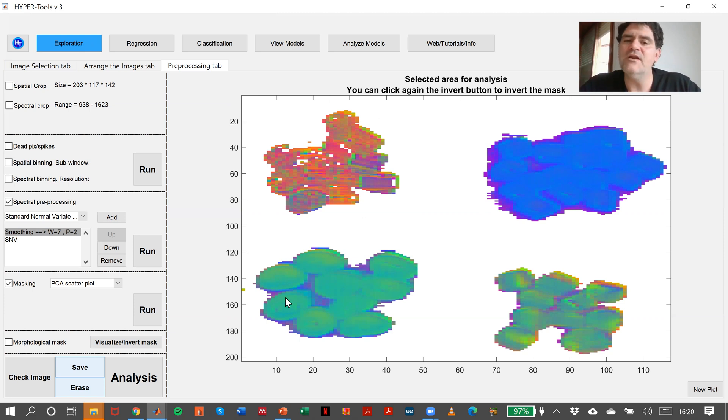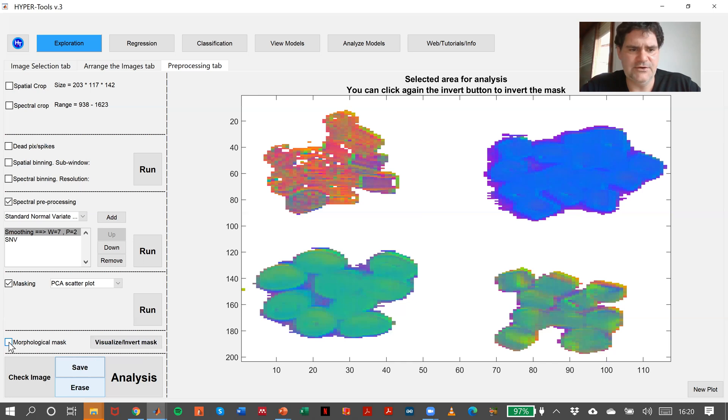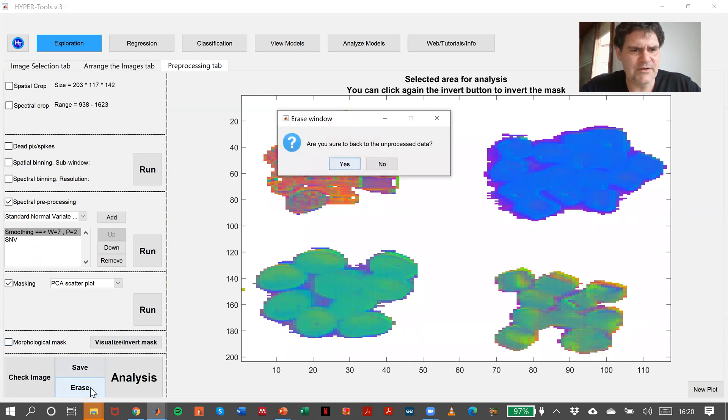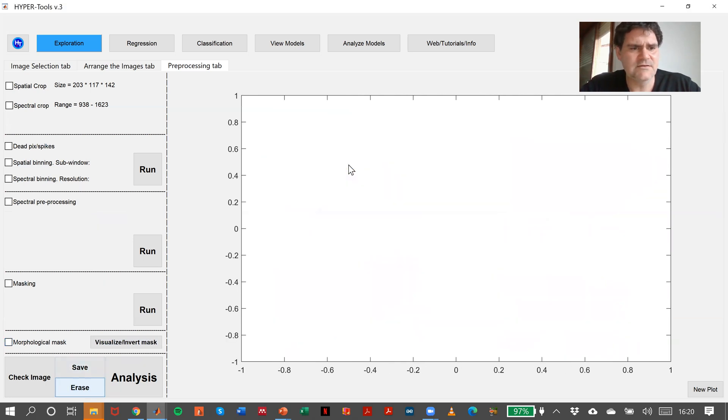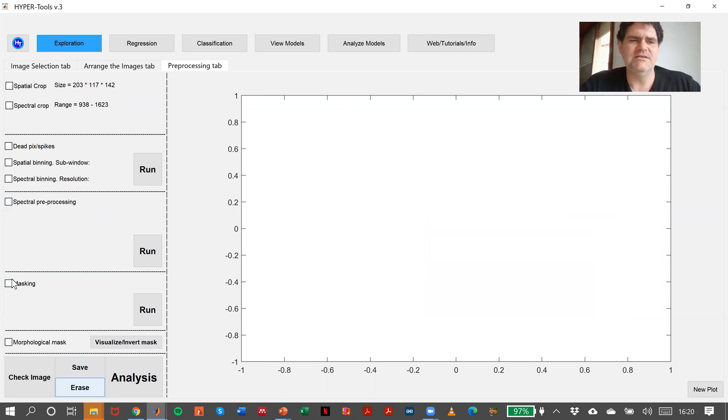If we are not happy with this mask, as I told you, we can make morphological operations, but we will learn how to do it later. Let me show you a little bit more of the masks. It's convenient to make some preprocessing before doing the masking.